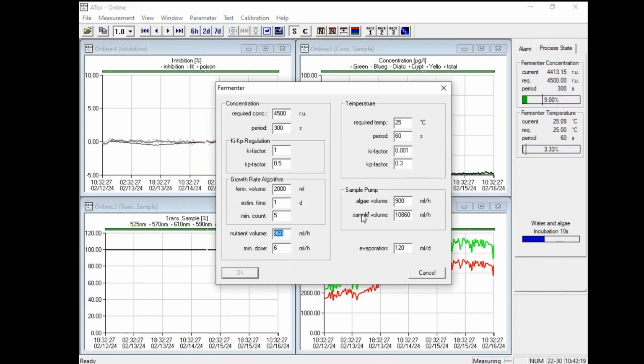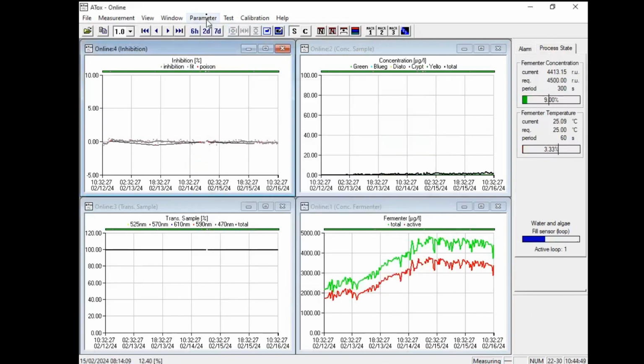That is the main pump, which is pumping any water type through the system, the reference water and the sample water, in the case also the reference toxin solution. And all these 3 values are metered and must be metered more or less exactly, but later I explain an assistant which is helping to fix these values, or to meter these values.